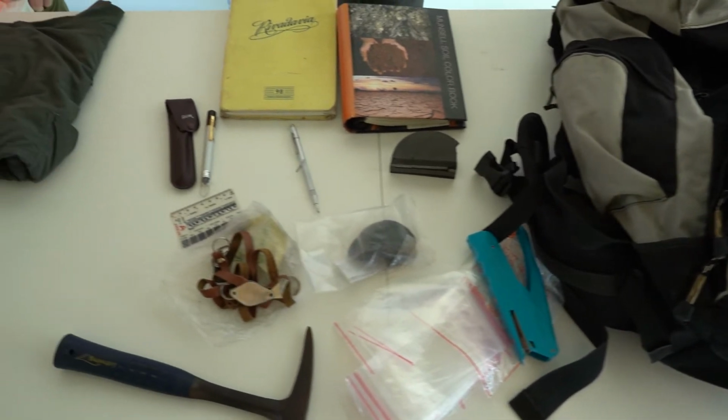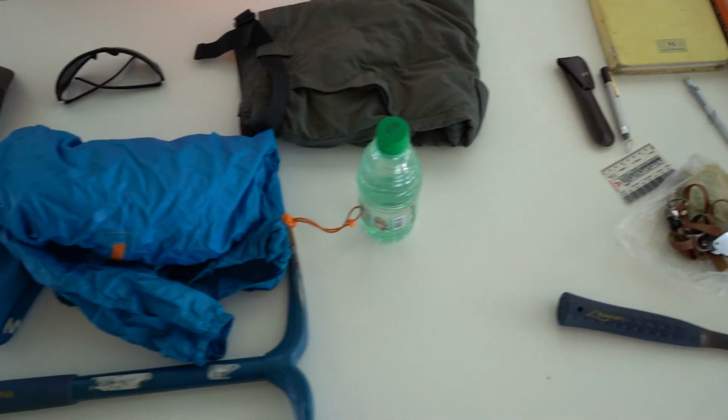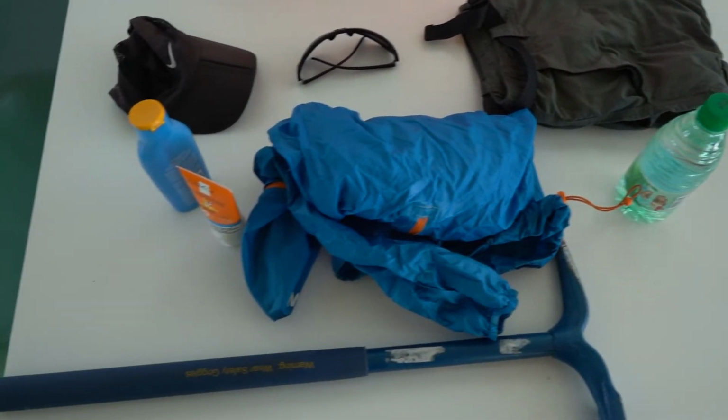So, hello little fella. This is a sandstone. This is a rock sample. So first, what we need to do is to go to the field and select some place of interest where we have a geological formation. So we break up a little bit of it, or we take part of this formation from a well and we bring it to our labs.